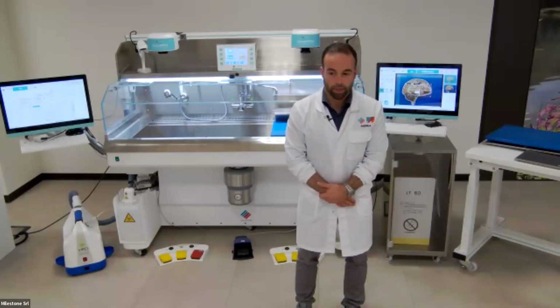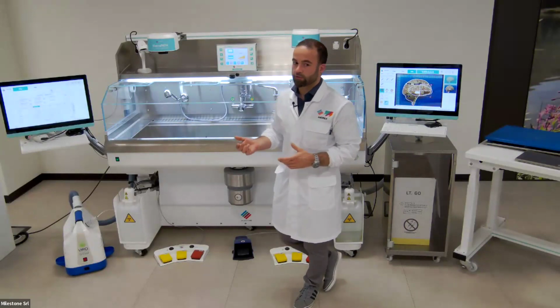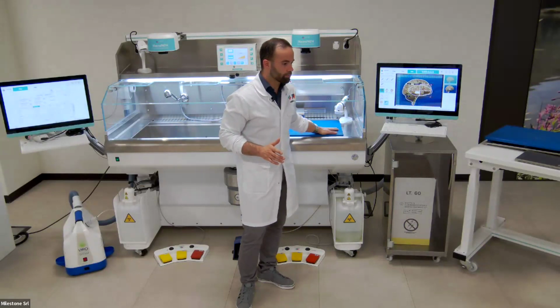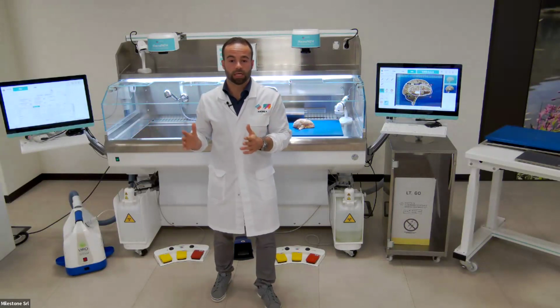Perfect. I have one final question divided in two parts. The first part is this one. Is it possible to work side by side with a lab technician? We have a pathologist who does the dissection and the lab technician who makes the marking. Yes, it's possible. Of course, as I previously mentioned, we have the possibility to have the double operator setting. So two cutting boards, one beside the other.